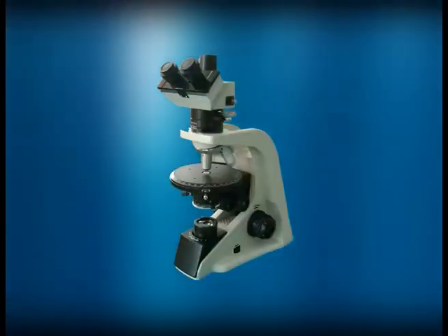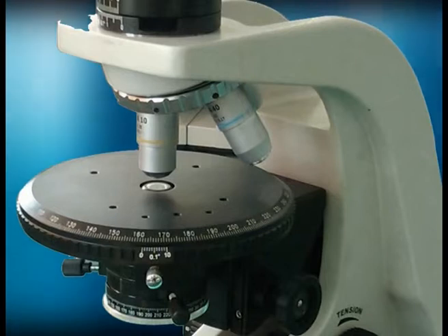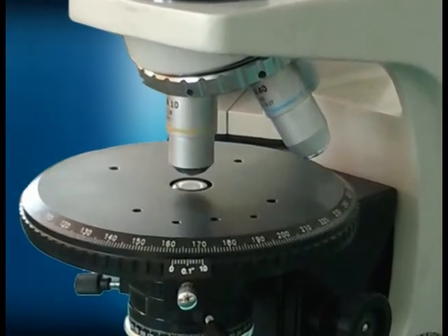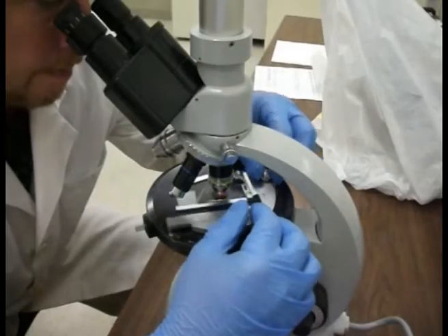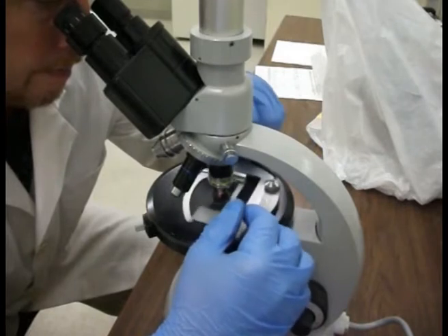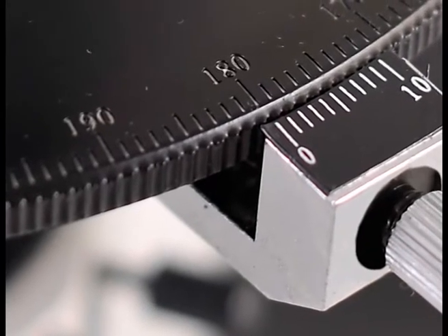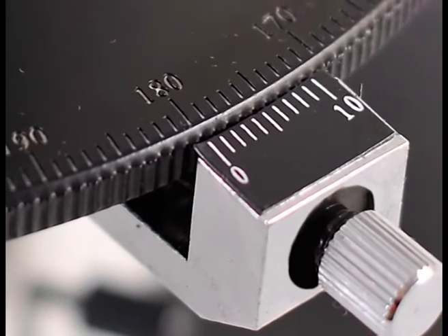The microscope stage, in its simplest form, is a circular disc with an opening in the center through which the light passes. The thin section of a mineral or rock is held in place on the microscope stage, usually by spring clips. It is rotatable and is graduated in degrees with a vernier attached to it.